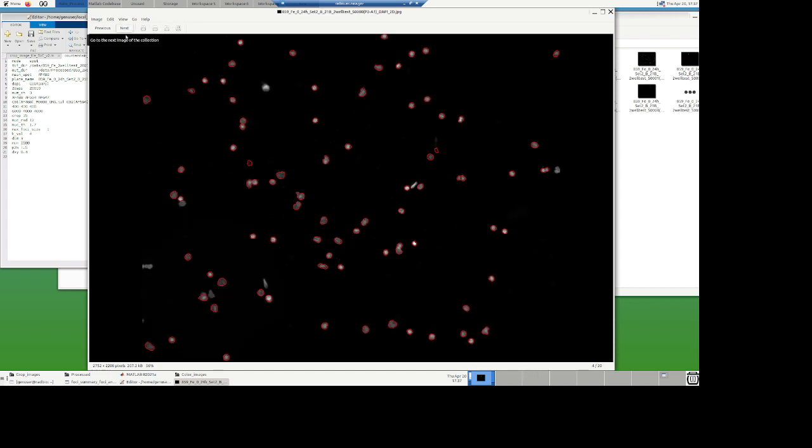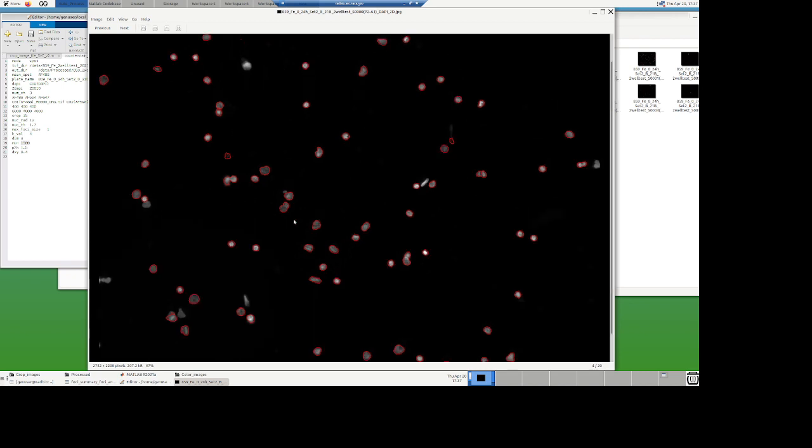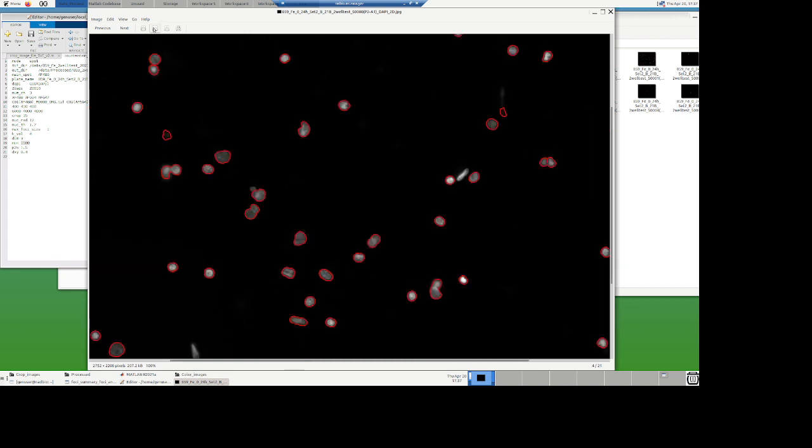Next is the DAPI. So that's DAPI, that's my pattern. That's what I use for nuclear segmentation. And you can see that those are really beautiful and they have a pattern. If I were to zoom on it, let's see if I can zoom more, maybe less. You see this pattern, how beautiful they are? And you can see how those cells look very different, nice and spherical cell versus deformed and bigger, different intensity. That's probably a cluster of cells, frankly, looking at it. So that's unfortunate. That definitely looks another cluster, two cells one on top of each other.